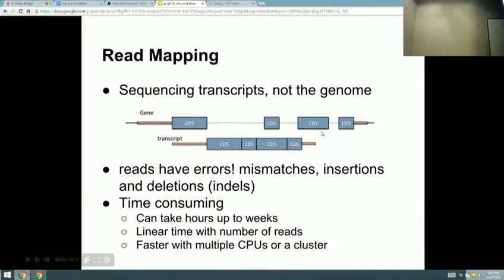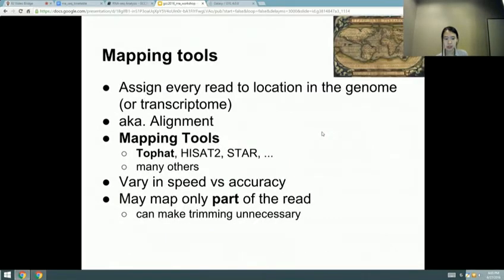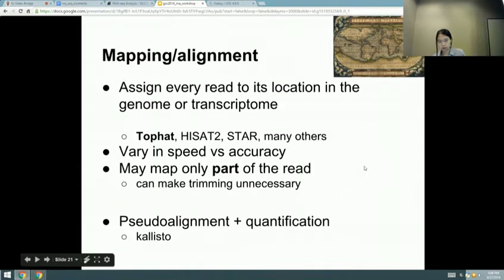So you're probably all familiar with alignment, and here we have only the coding sequences, so we don't have the introns, and we're going to find where they belong in the reference. You can provide the data collections. Choose the 3 icons in a row. Choose RNA-seq.